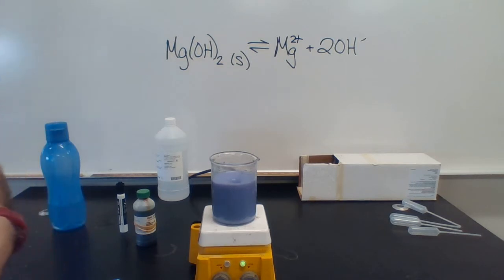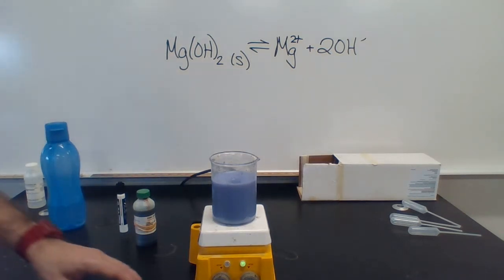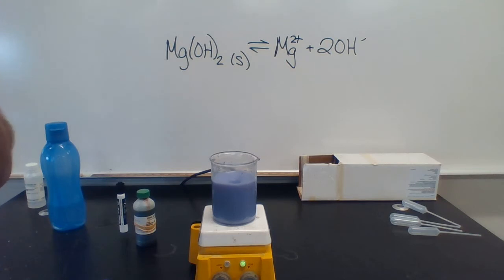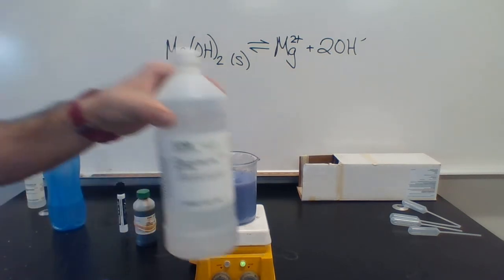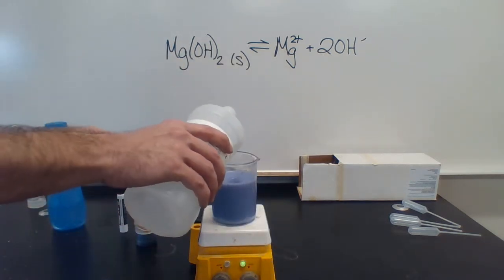With Le Chatelier's principle, what we want to do is add or remove something or do another stress, which could be changing our pressure or volume for gases or changing our temperature for reactions to get it to shift. But here we're going to focus on shifts related to concentrations. So what I have here is hydrochloric acid.